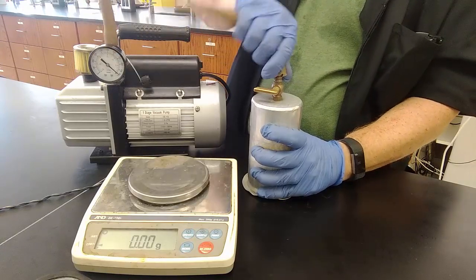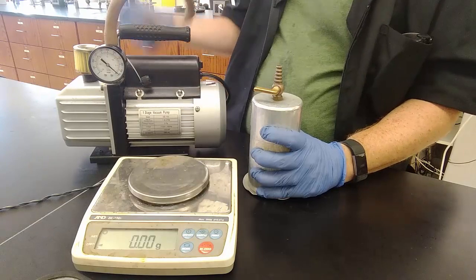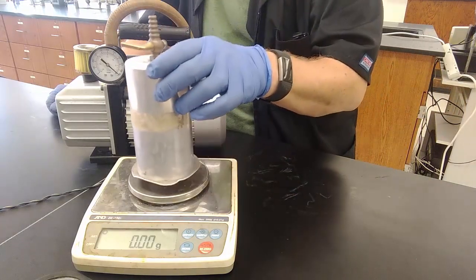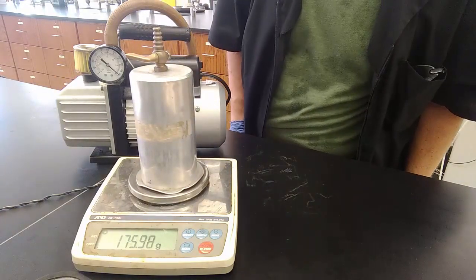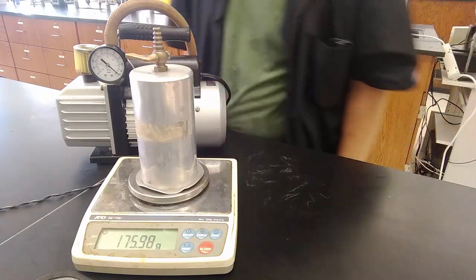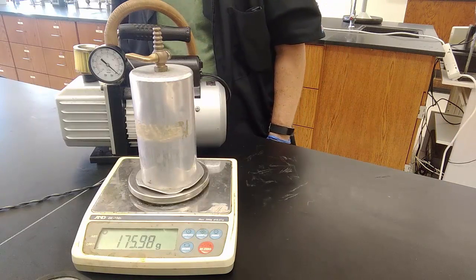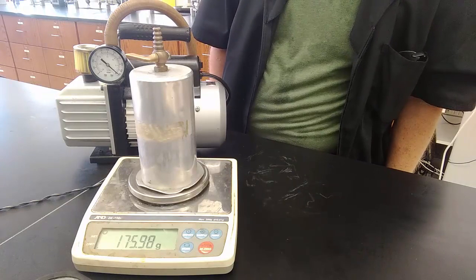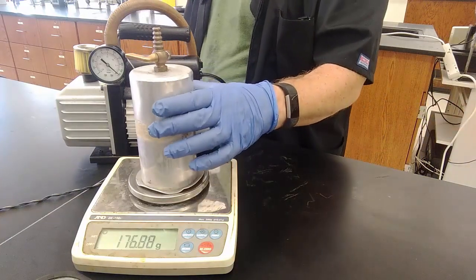There should be a little air refilling into the hose. Let's see if we can hear it. No. All right. And then, step 4, weigh the evacuated densitometer. Our balance was tared, not touching the table. 175.98. 175.98. Okay? We might need to use a better balance than this one, but we'll try it out.